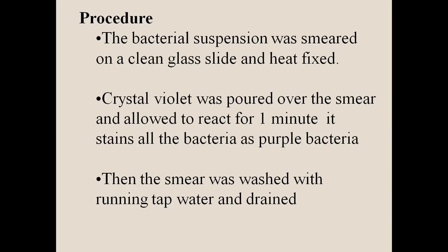Then after that, you just prepare a staining tray. In that, you keep the slide and add a few drops of crystal violet. That is the primary stain. You add a few drops of crystal violet on the slide.